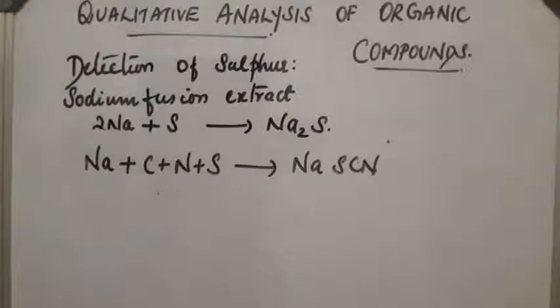This will interfere with the reaction, so first we have to decompose this thiocyanate into sulfide ions and cyanide ions. Then only we will get the usual test.